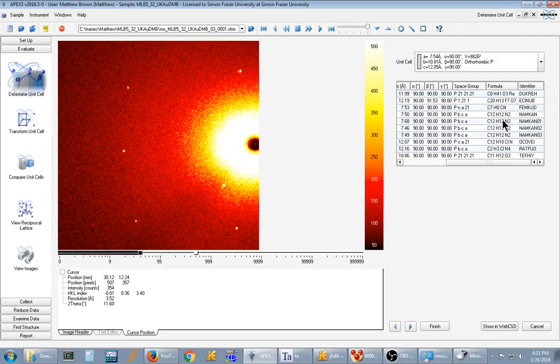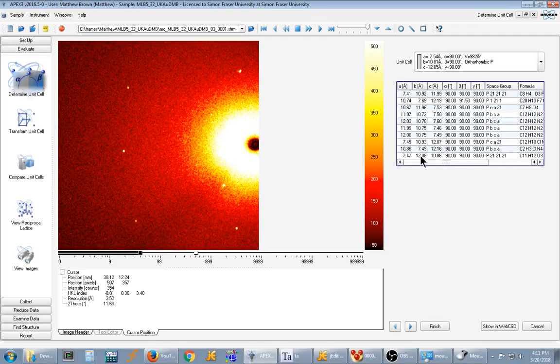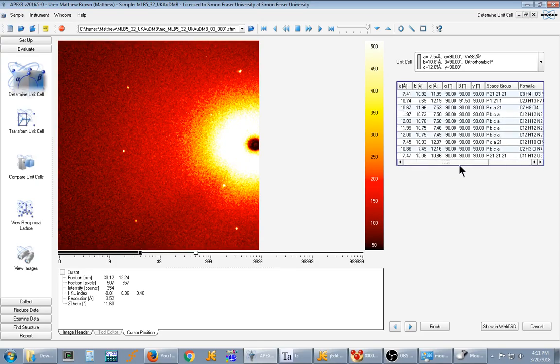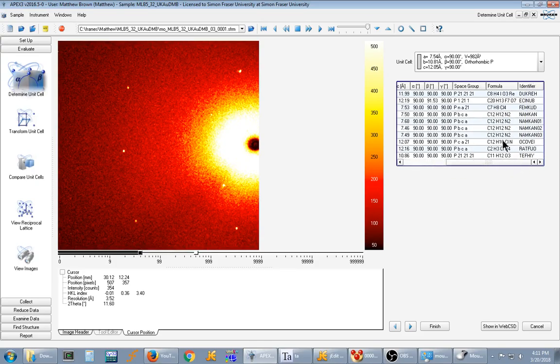This is the ligand I ran by accident and you'll see a list of formulas and unit cells. Now the unit cells will all look like yours of course. The space group could in theory be helpful but the useful thing here is the formula.